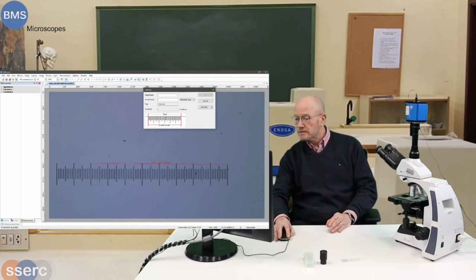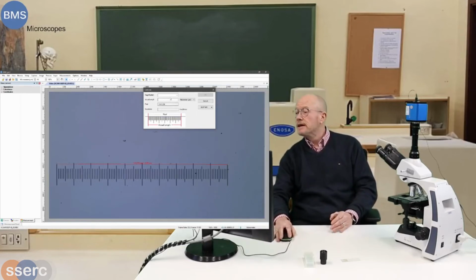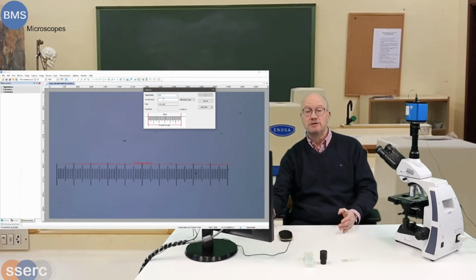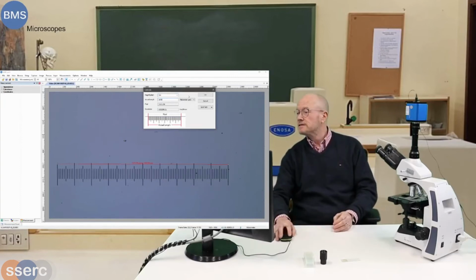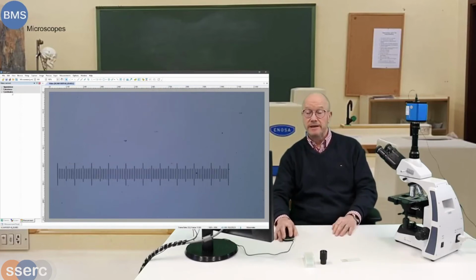Make sure that stays on the back now. I was moving the complete line and it should only extend the length a bit. What you can see now, it starts at 0, ends at the last bit of that micrometer. Again, we put in the magnification here, 10 times. It's 1000 micrometers again. There it is. Give it an OK. It's calibrated now for the 10 times.